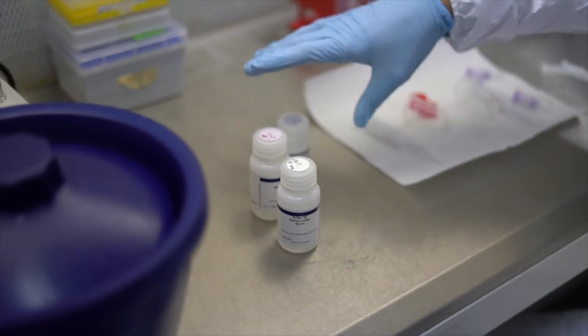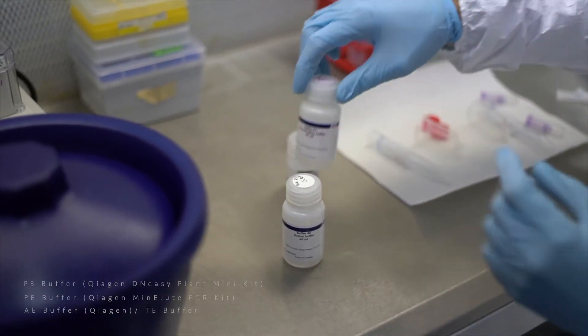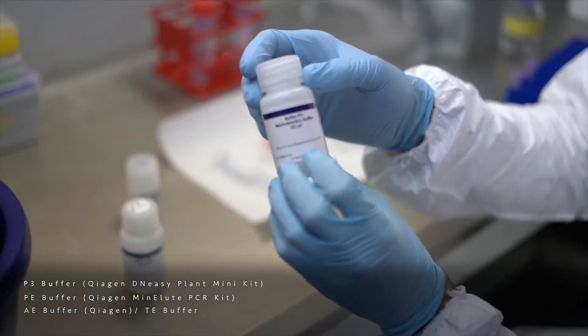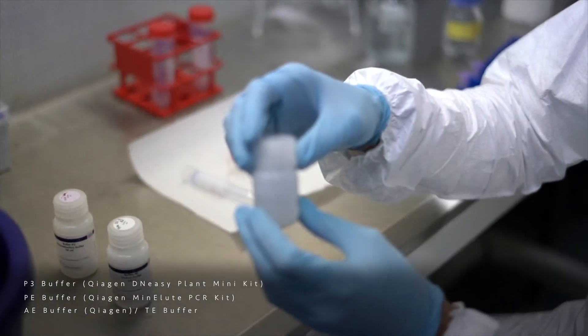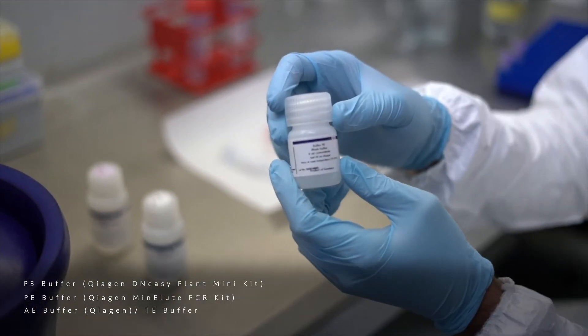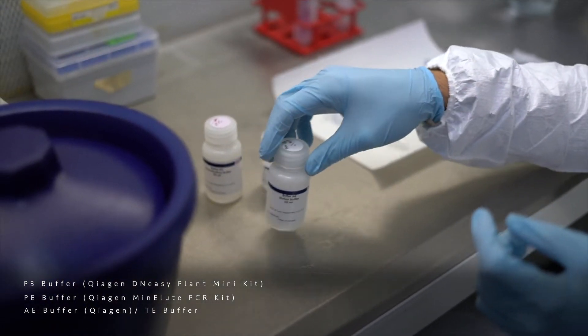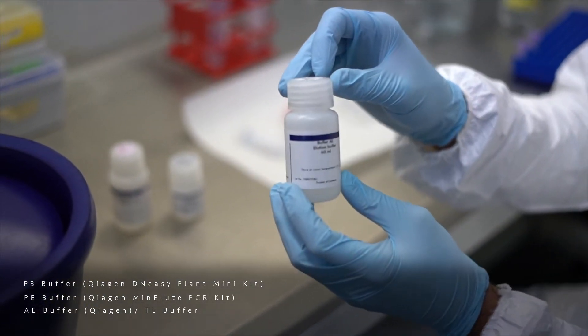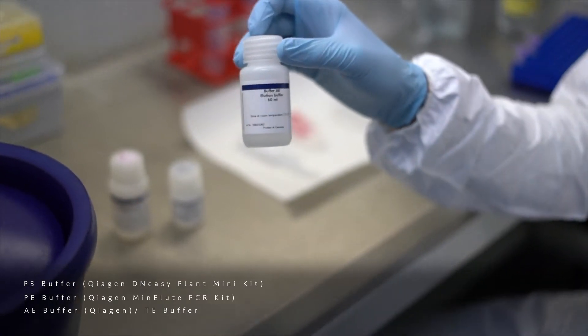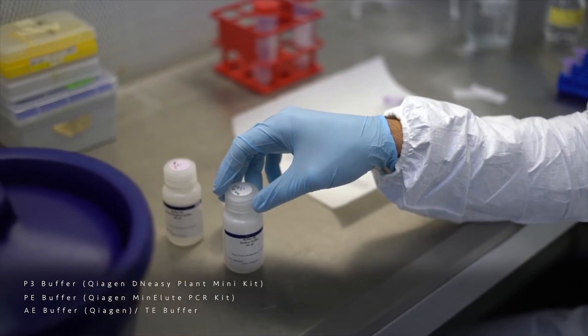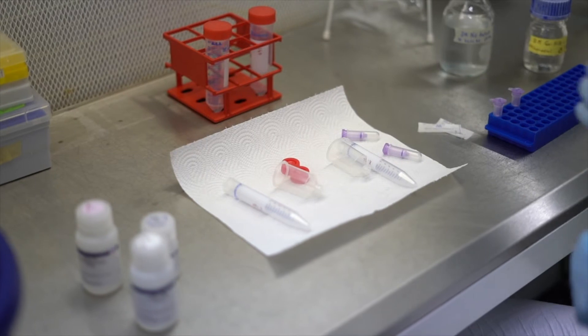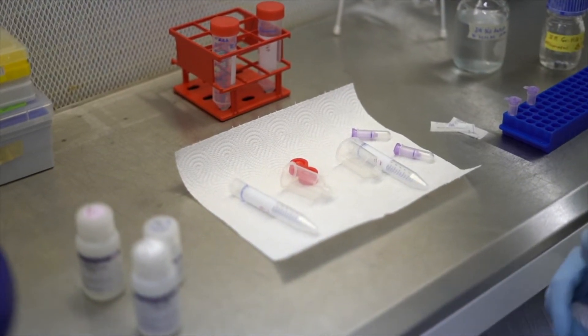We will need also three other buffers: the P3 buffer from a Qiagen extraction kit, PE buffer also from Qiagen MinElute kit, and finally for elution we are using an AE buffer also from a Qiagen plant mini kit. But actually you can also use the TE buffer if you want. Good, let's build then the binding apparatus.